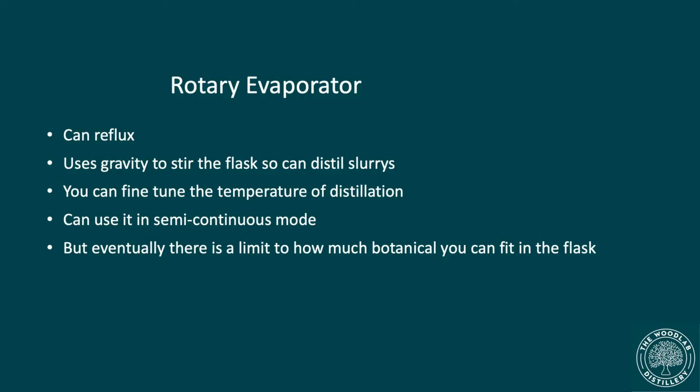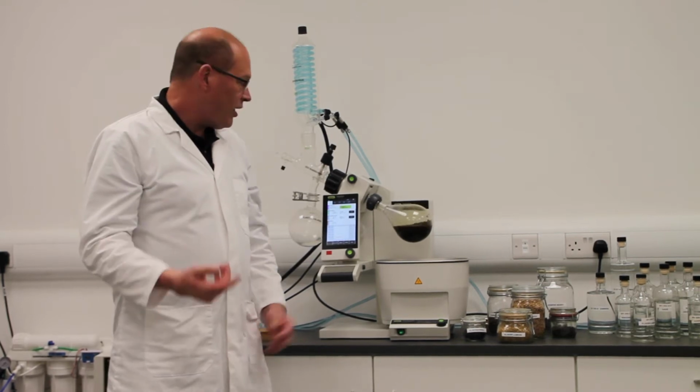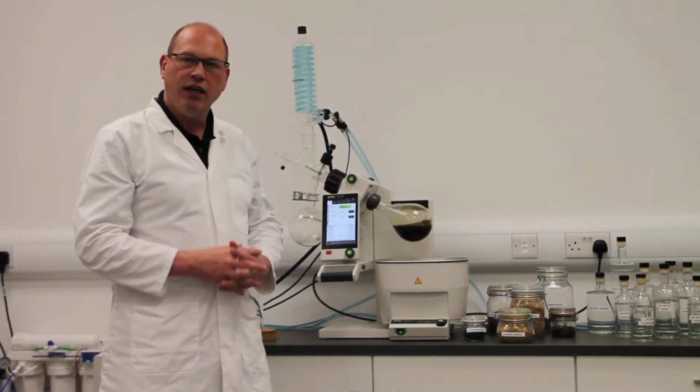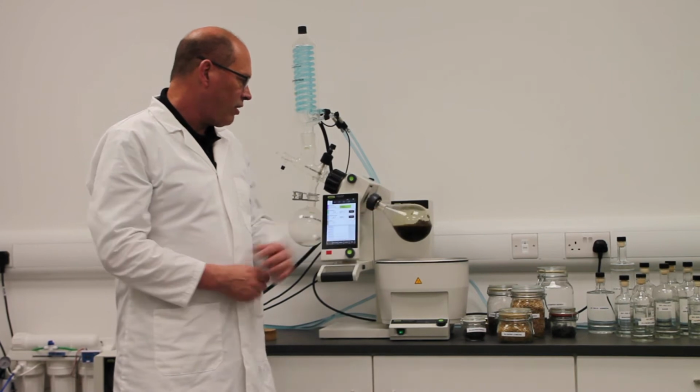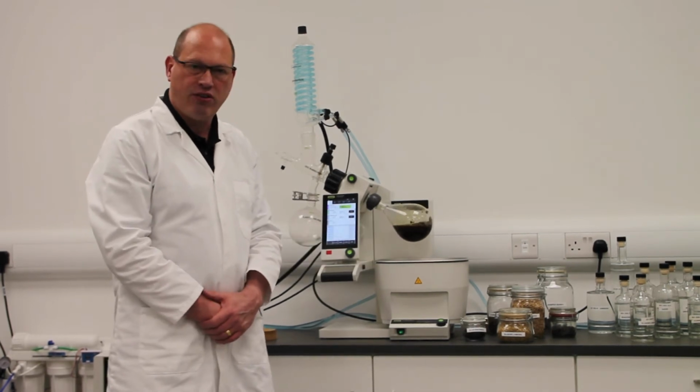This is found in most chemistry labs, and it's used normally to remove solvents from a mixture. In here though, we have juniper berries. They've been ground up to a nice fine powder to increase the surface area of extraction. And as you can see, you've got a really thick slurry. And that's the advantage of a rotary evaporator, in that it uses gravity to stir the contents of the flask. By mounting it at this angle, it then allows something as thick a slurry as this to be distilled without having any issues. There's no way you would do this in a traditional still.